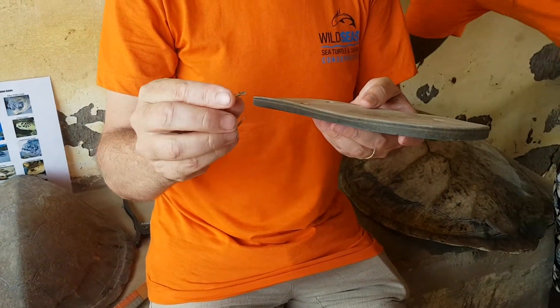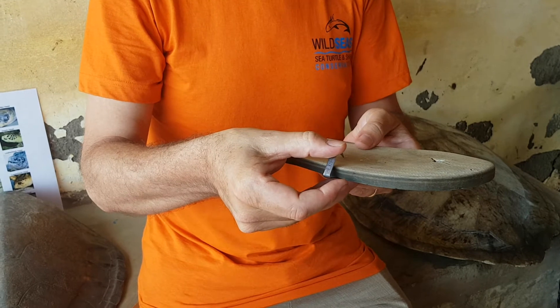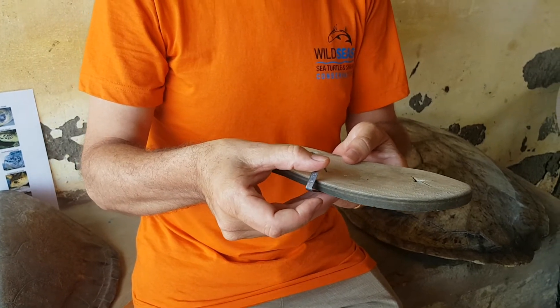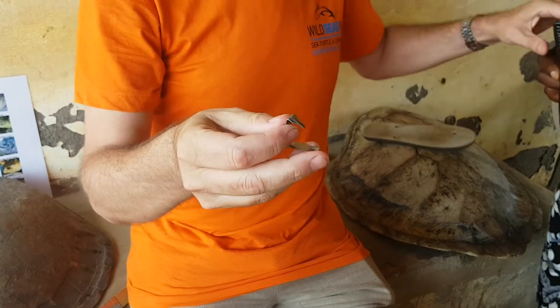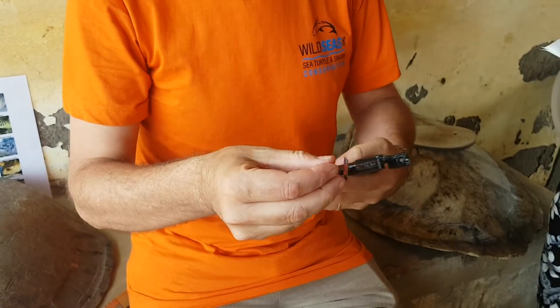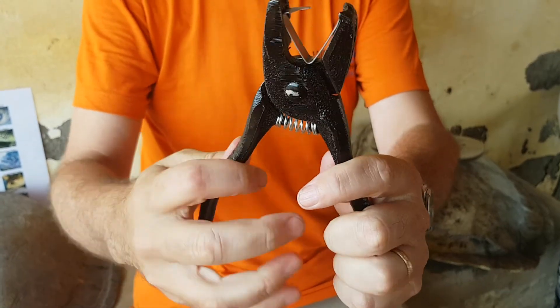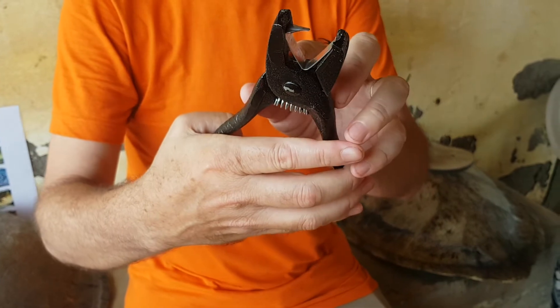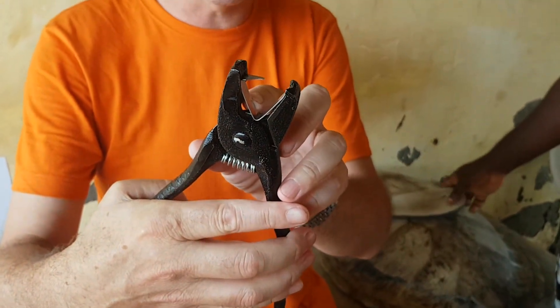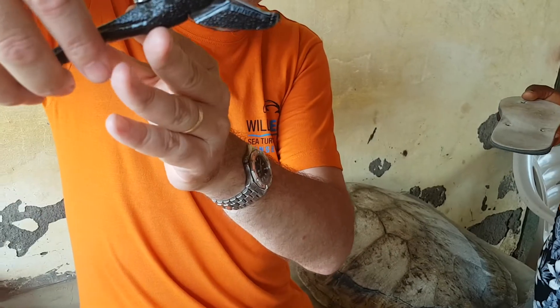We need to apply this tag through the flipper in a safe and simple manner that causes a minimum amount of discomfort to the Sea Turtle. We take our actual tag and place it inside the applicator. The number side of the tag, which carries the unique identification, is on the side that has the pin, and we will apply the tag in this fashion.